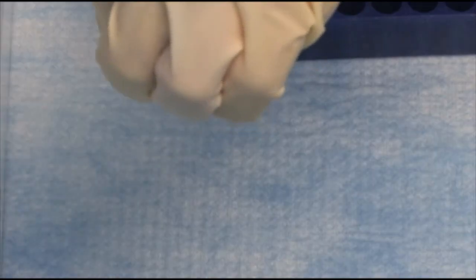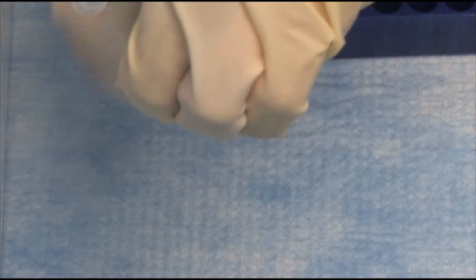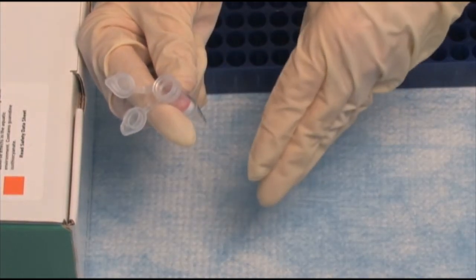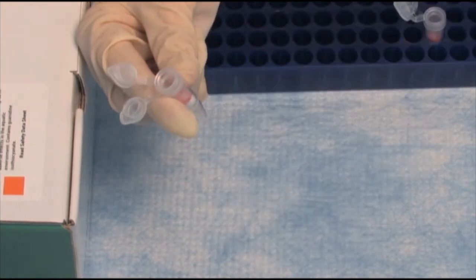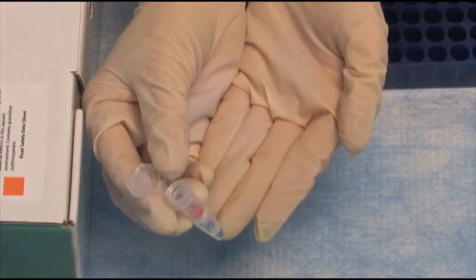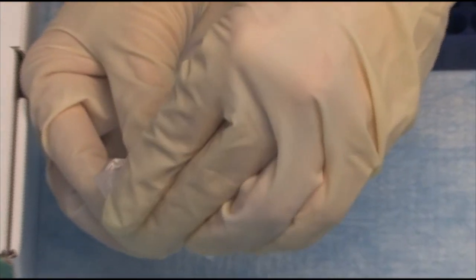Now, after the third wash, we are going to take the top of the tube off and insert it into a collection tube. So now we're going to add water to the top and elute the RNA with water into the bottom of this collection tube. We take it to the centrifuge, centrifuge it, and then here's the final product. We have water in the bottom with the RNA. We will remove the spin column, close this, label it, and we are done with our RNA isolation.